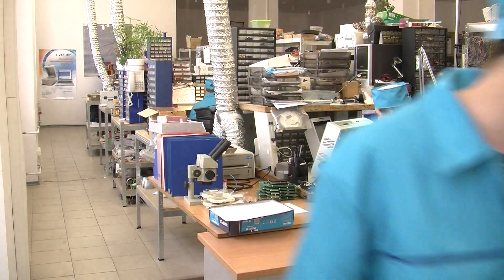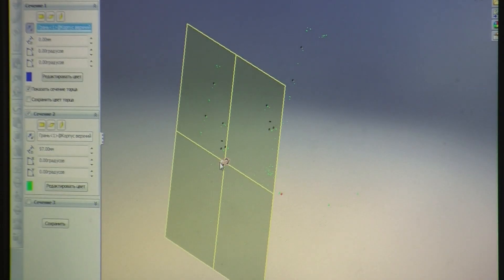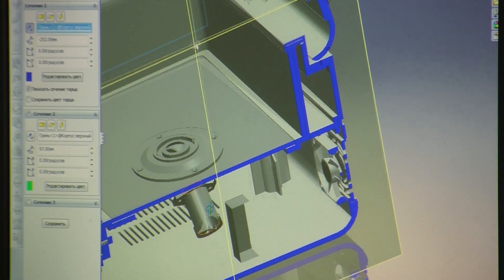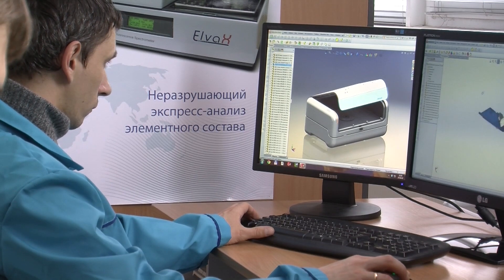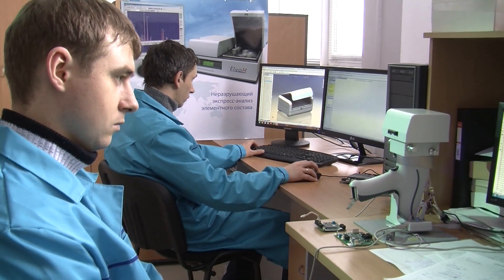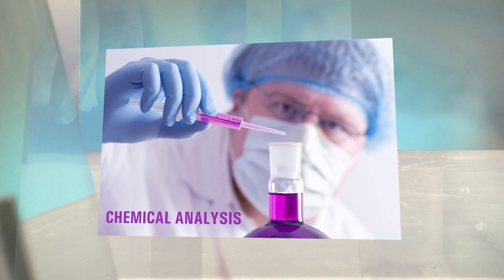Elvatec has been manufacturing EDXRF equipment for more than 15 years, being one of the pioneers in creating a range of compact and efficient benchtop EDXRF spectrometers. Elvatec Spectromatic solutions have demonstrated top-notch performance in a vast array of industries where elemental analysis is required.